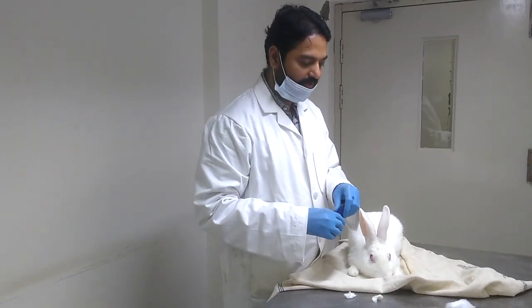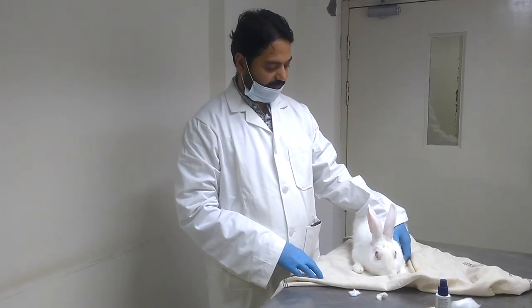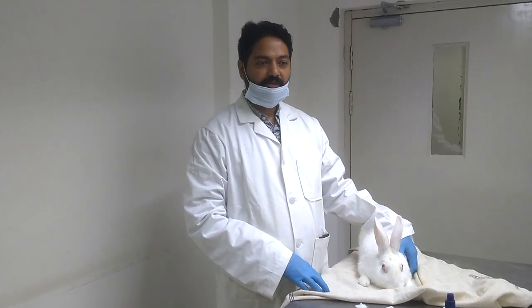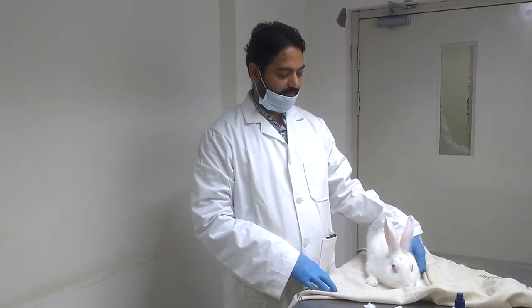So in the whole of this process, I think you have got to know all the steps of antibody development in rabbit. We prepared the immunogen, we injected the immunogen, we isolated the blood after giving sufficient booster doses, and the whole process is in the rabbit. I think you understood most of this process and you liked it.